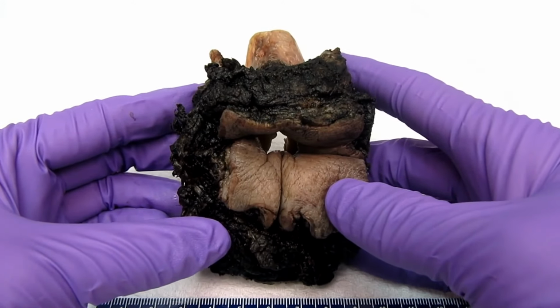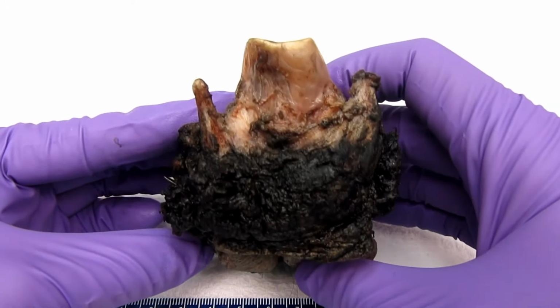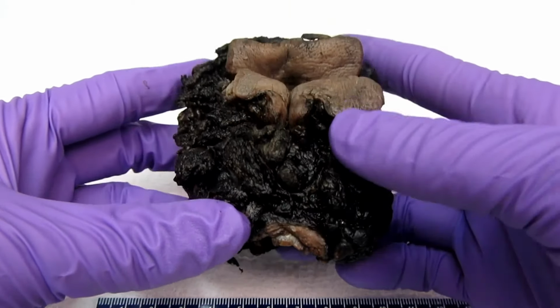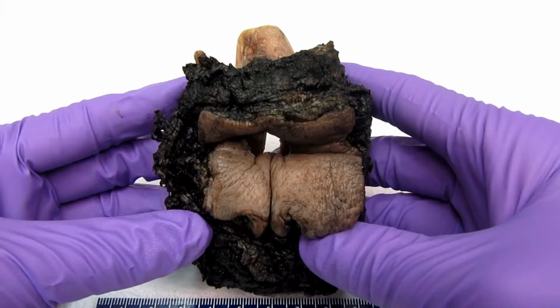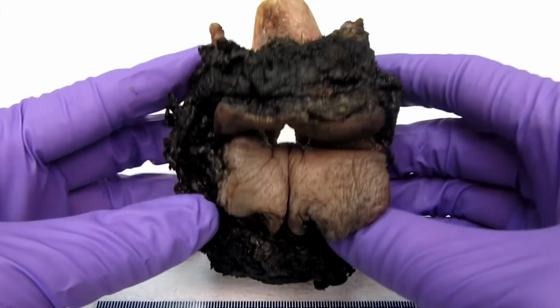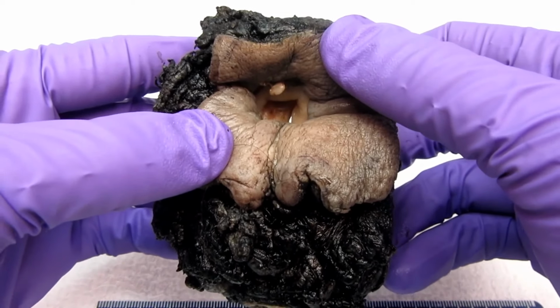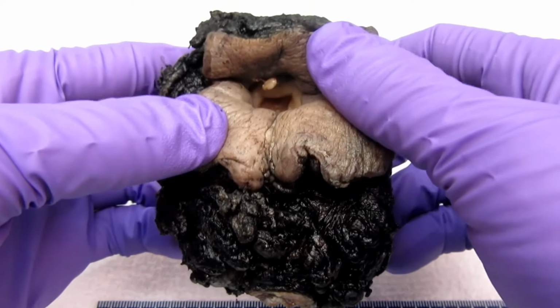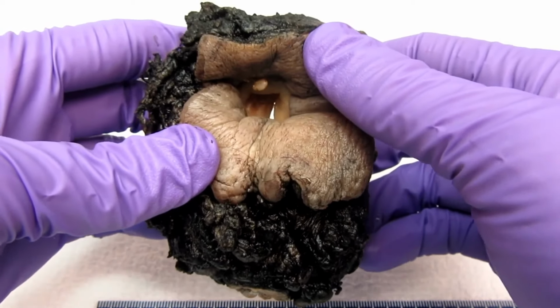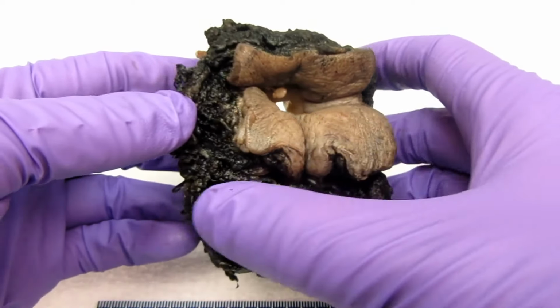So just to get oriented, this is an anterior view of the larynx with our superior aspect here and our inferior aspect here. We can immediately identify a couple of structures, including the epiglottis, hyoid bone, and some anterior skin with a central defect. Normally we would expect that this area represents a tracheostomy site, but there are a few reasons why this is probably our necrotic lesion instead. It should become apparent as we go through the rest of the specimen.